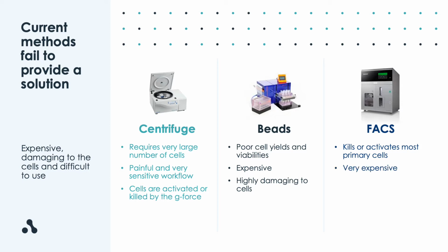Additionally, these instruments are prohibitively expensive. An average FACS platform these days is about $250,000. And finally, these are really high-tech instruments requiring a full-time experienced operator. These are not instruments that are easily incorporated into everyday workflows with a standard user who just needs to isolate a specific live fraction for a downstream experiment.